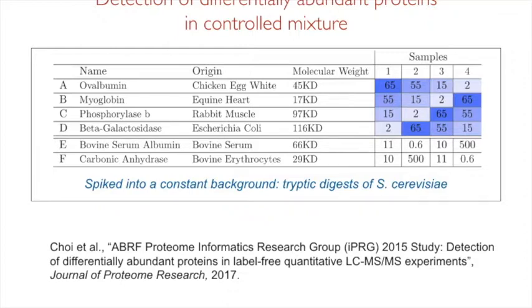And this is actually very effective because, for example, if you want to compare concentration of unit 2 and concentration of unit 15, you can do it for every protein here, here, here, and here. So it means that if one particular protein was somehow negatively affected, for example, by peak overlaps or some other issues, well, you have another protein which will have the same changes. So you can actually average over multiple proteins, but at the same time, the overall amount of spiked proteins in the sample stays constant. This type of layout allows us to make many comparisons averaged over many proteins.